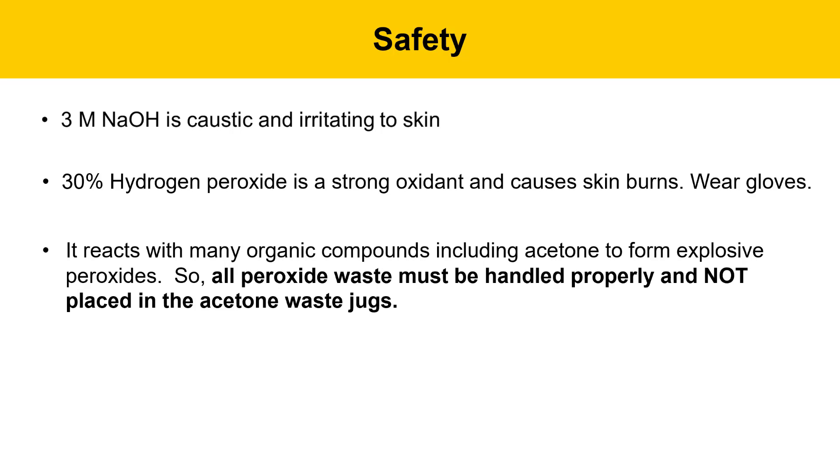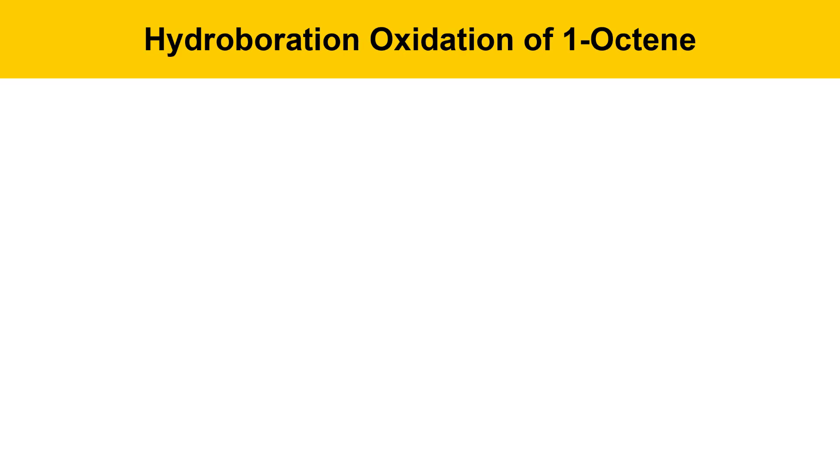Furthermore, hydrogen peroxide reacts with many organic compounds, including acetone, to form explosive peroxide, so it's really important that all peroxide waste be handled properly and not disposed of in the acetone waste jugs. There'll be special waste containers put out for the hydrogen peroxide waste you generate today. Finally, use care when working with needles.